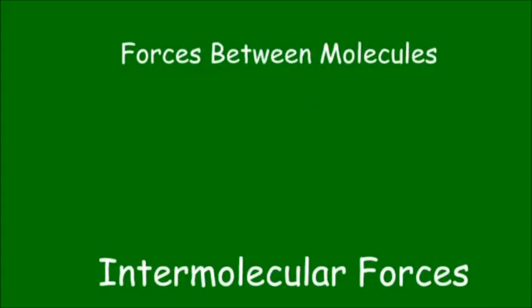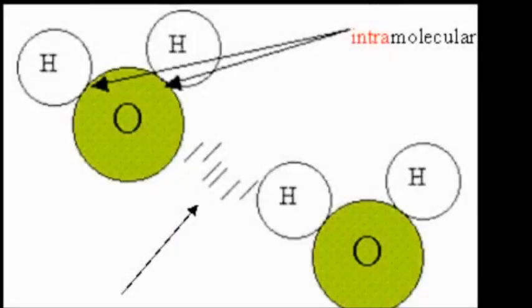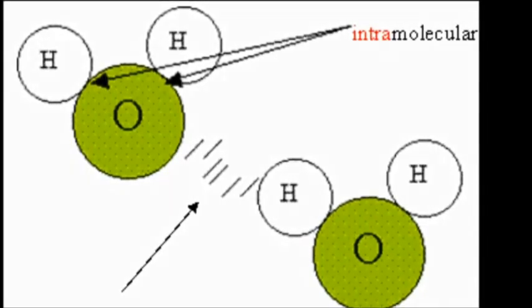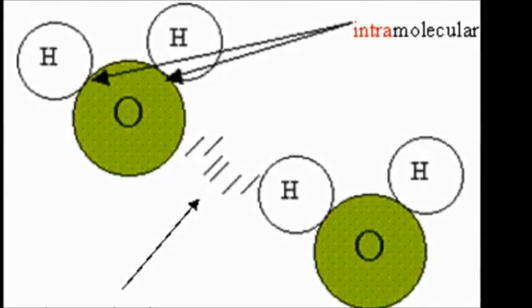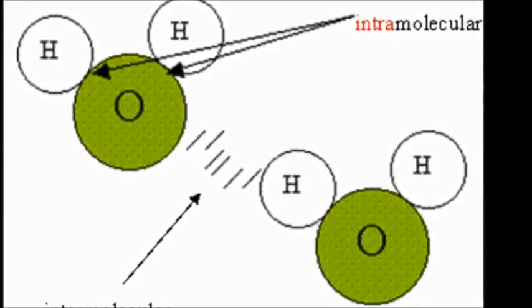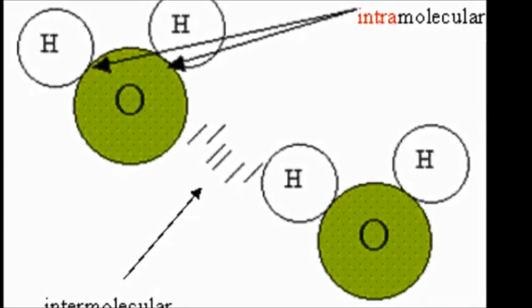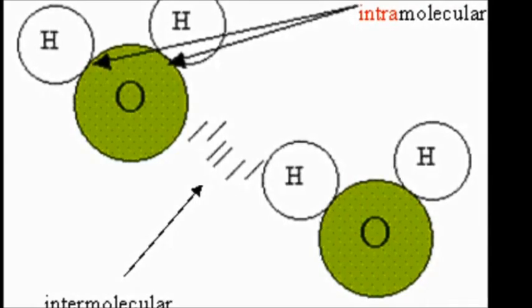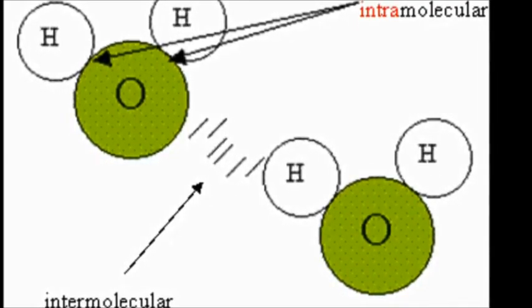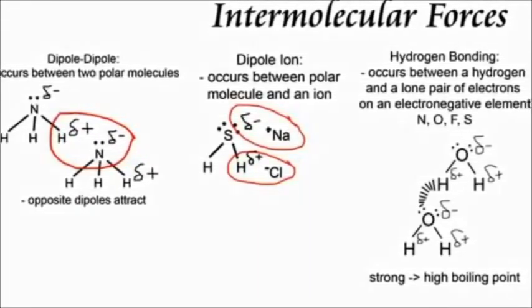In this experiment, we will be observing how substances with different intermolecular forces boil at different temperatures. As you've probably already learned, intramolecular forces are the forces within a molecule, the forces that keep the molecule together, while intermolecular forces are forces connecting different molecules and are responsible for keeping a substance in a solid or liquid phase, which means the intermolecular forces are the forces that have to be broken in order for a substance to vaporize. In this experiment, we will be focusing on the intermolecular forces since those are the forces that must be broken in order for a substance to boil.